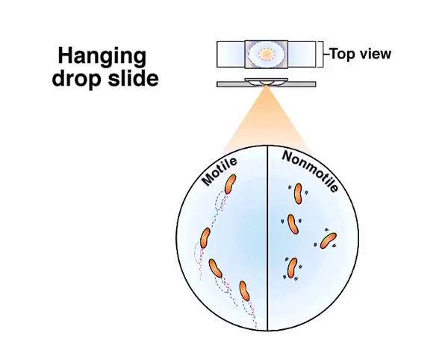If the culture is grown on a solid media, it is mixed with a drop of distilled water before placing on the cover glass. The cover glass is inverted over the concavity so that the drop hangs freely and the edge of the cover glass adheres tightly to the Vaseline coated periphery of the concavity. The microorganisms present in the hanging drop are now observed for their type of mobility under the microscope as shown in figure 3, hanging drop method.